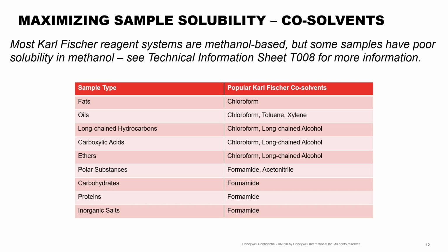To save time with most of these, you can use pre-mixed working media that has the co-solvents blended in already, if these are samples that you're typically analyzing, such as the Liposolver series, among others. You will need to remember, though, to always take some precautions when working with formamide. Due to its reactivity, we don't recommend pre-mixing this. We don't use it as a pre-mixed co-solvent. We do have it available as a solvent, but again, not pre-mixed, just work it up when you're ready to analyze your samples.